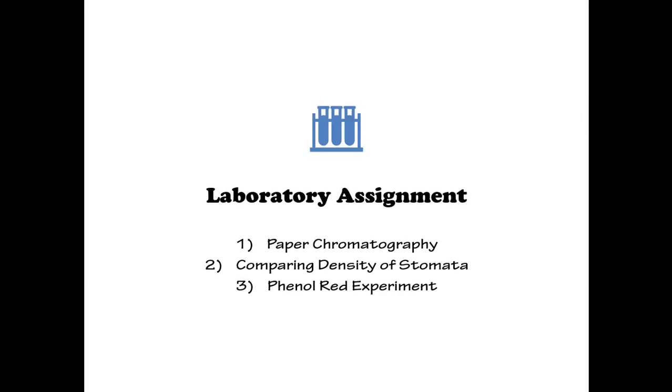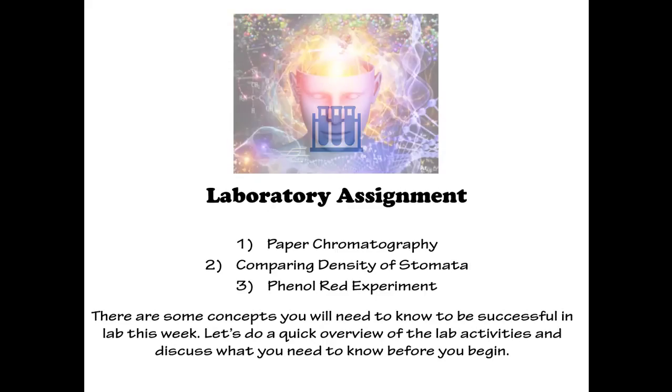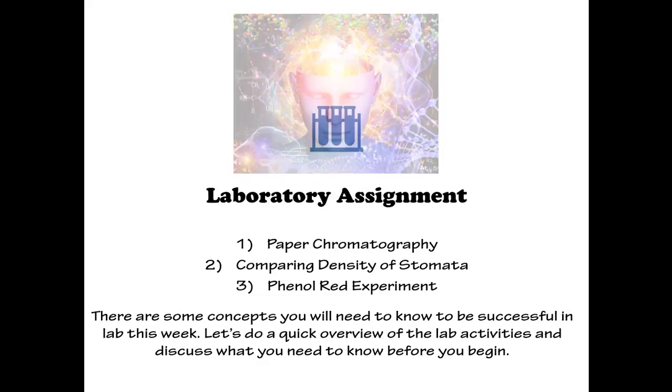This week for your laboratory assignment, you will be performing paper chromatography, comparing density of stomata, and a phenol red experiment. There are some concepts you will need to know in order to be successful in this week's lab. Let's do a quick overview of the lab activities and discuss what it is that you will need to know before you begin.